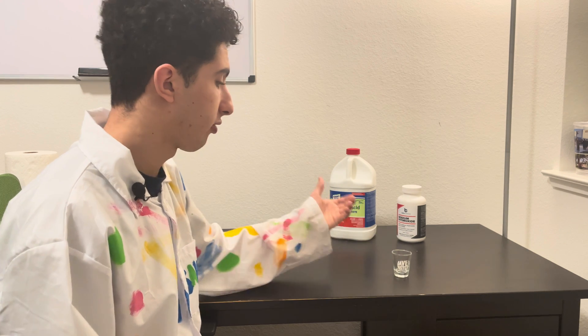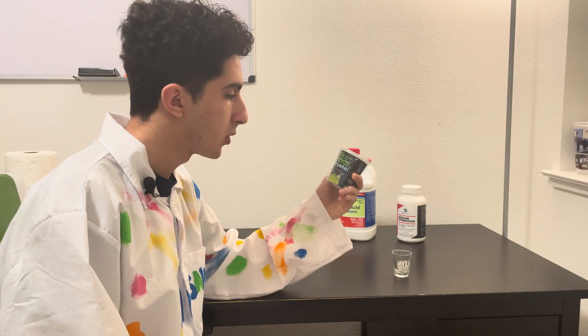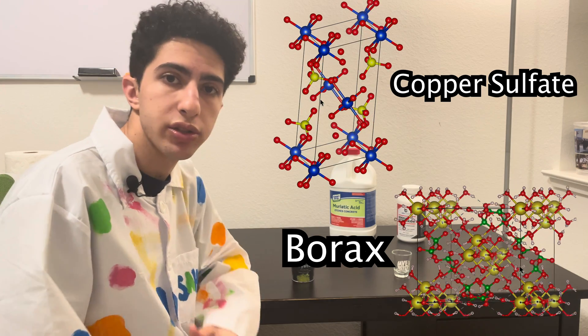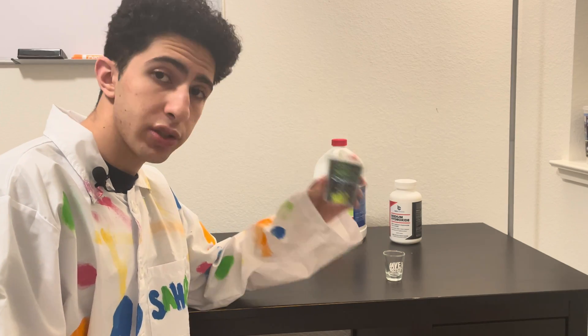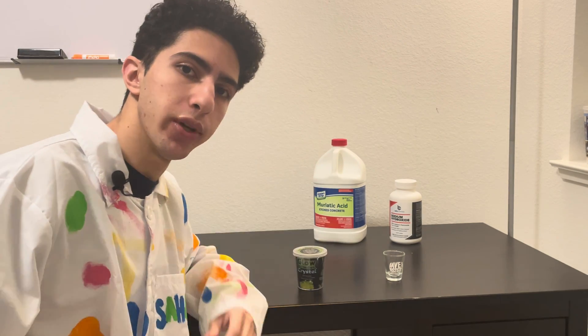Now this wasn't the only thing I got from Dave & Buster's. I also got this little kit for making glow-in-the-dark crystals. I've made plenty of crystals before and there's a number of different chemicals you can use to make crystals. But for this video I wanted to actually go through the instructions in this little kit and make some glow-in-the-dark crystals. So let's get to it.